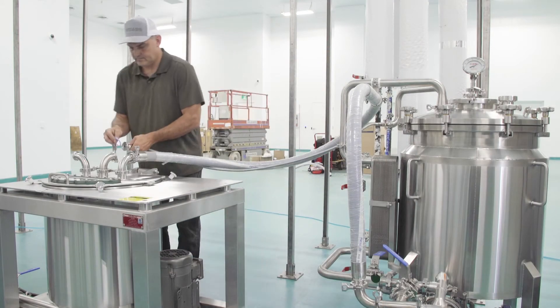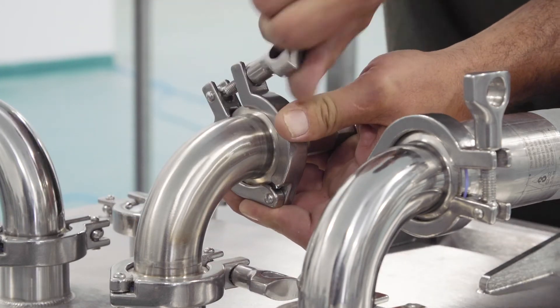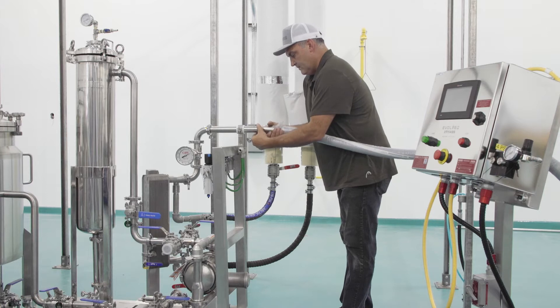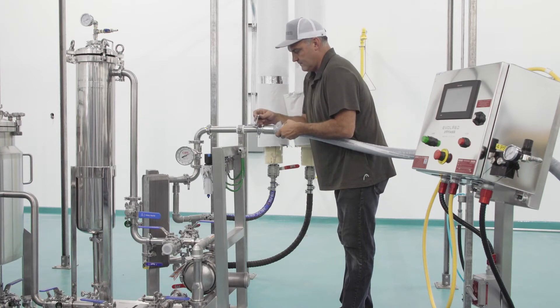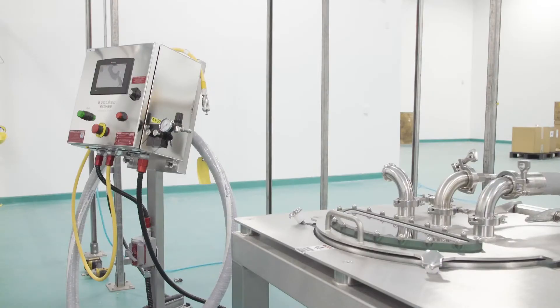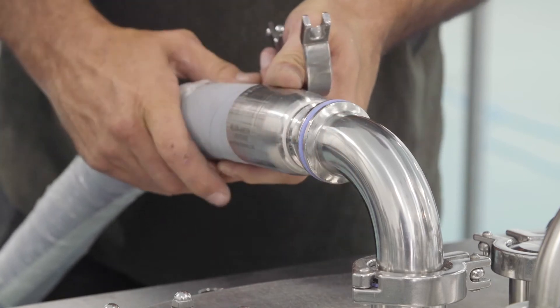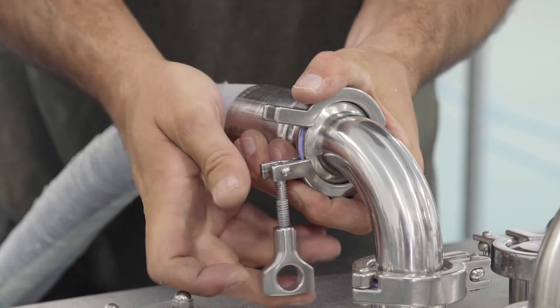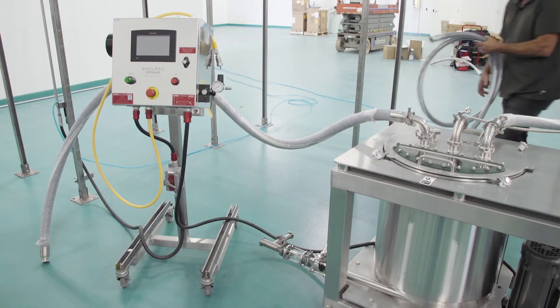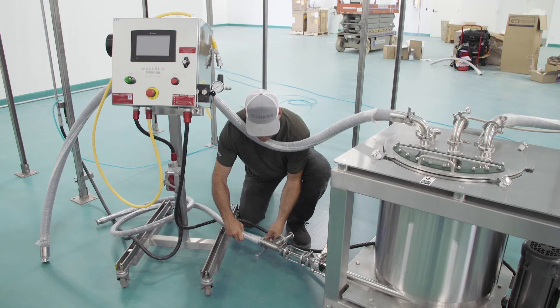Now connect the pressure equalization line to the centrifuge. Next, connect the heat exchanger on the filtration skid to the centrifuge. After connecting the sight glass and corresponding valve to the discharge port of the centrifuge, connect the filtration skid and centrifuge using the hose seen here.